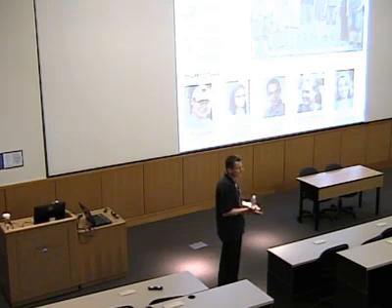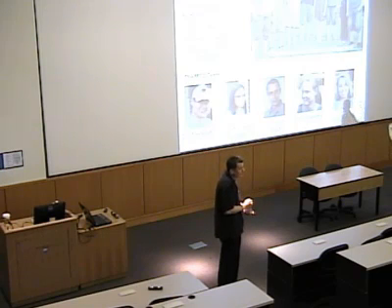But if you have something like non-heme iron, or mononuclear copper or some site like this, they don't have much A and B term intensity, so you wouldn't see them in your MCD spectrum. So it depends on what system you're looking at. But outside of hemes, A and B terms are usually really, really weak.